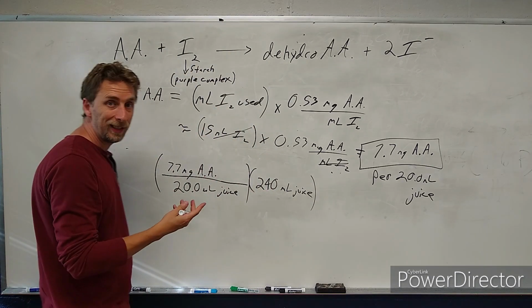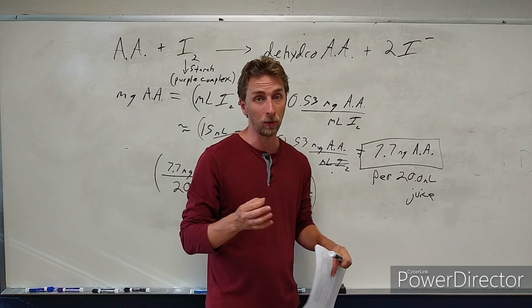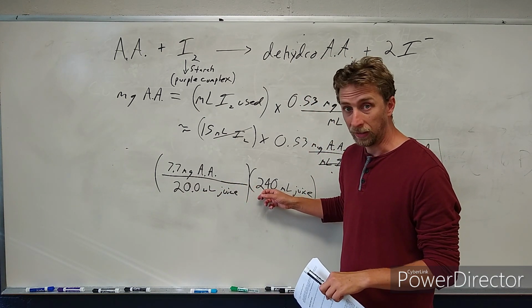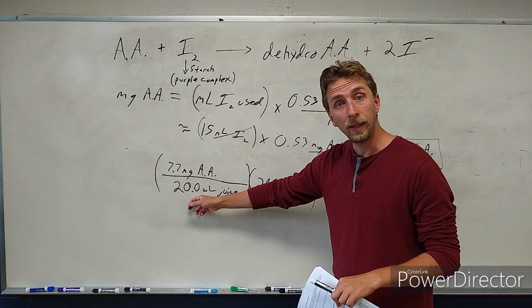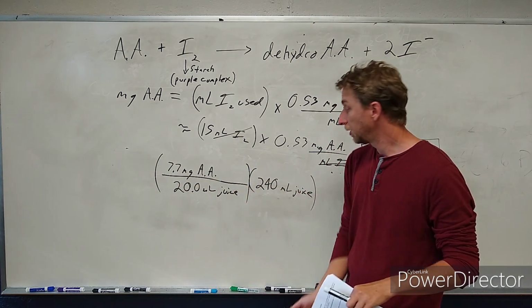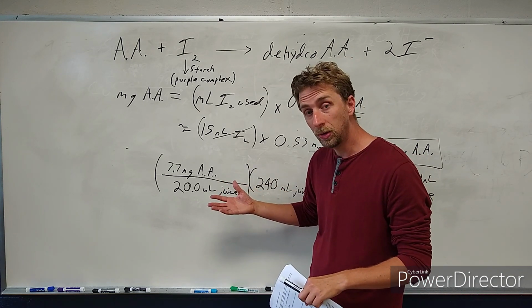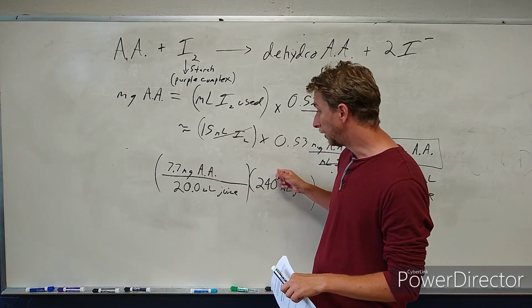And what does that equal? Well, think about this. It's good to have this stuff make common sense to you whenever possible. You say, I use a 20 milliliter sample of juice, right? Well, how many times more is 240 milliliters for a full serving? Well, 240 divided by 20 is the same thing as 24 divided by 2, which is 12. So 240 is 12 times more juice than we use for our sample. So in fact, all we need to say is 12 times more juice should have 12 times as much ascorbic acid in it, right? And that's what this is showing.